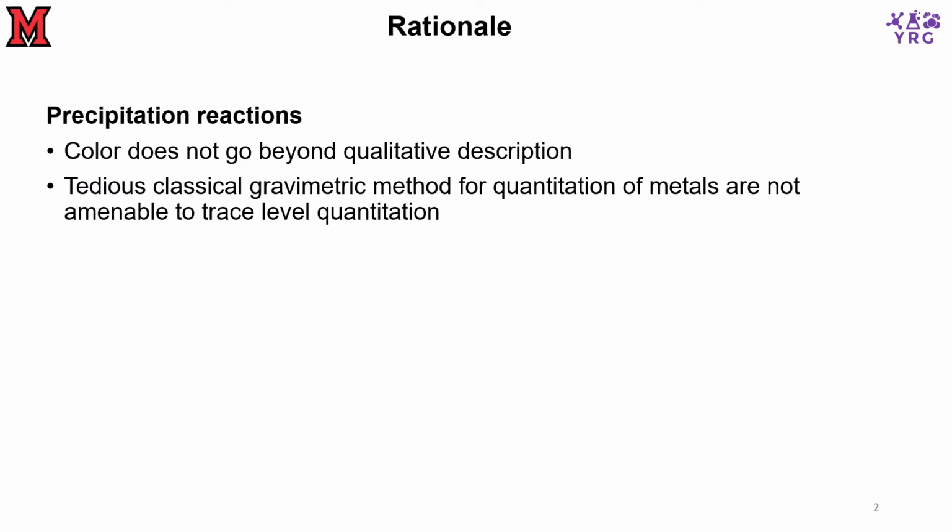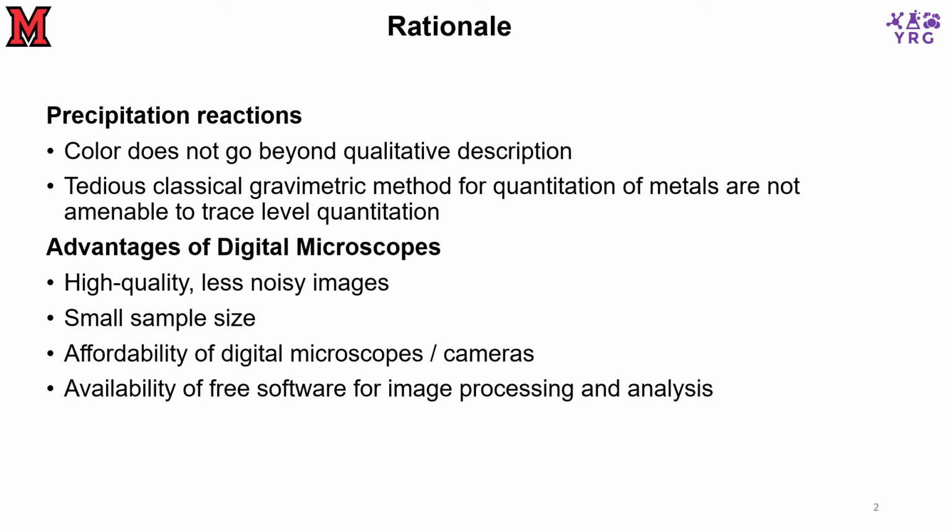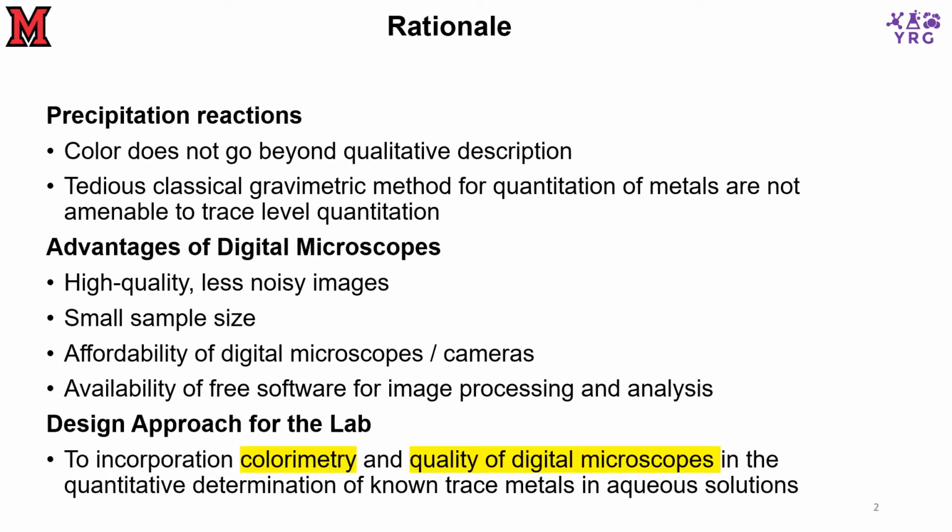The rationale behind this lab is seen in the limited use of precipitation chemistry in our teaching labs, as well as the current enhanced imaging sensors in digital microscopes. The design experiment therefore takes advantage of color and quality of digital microscopes.